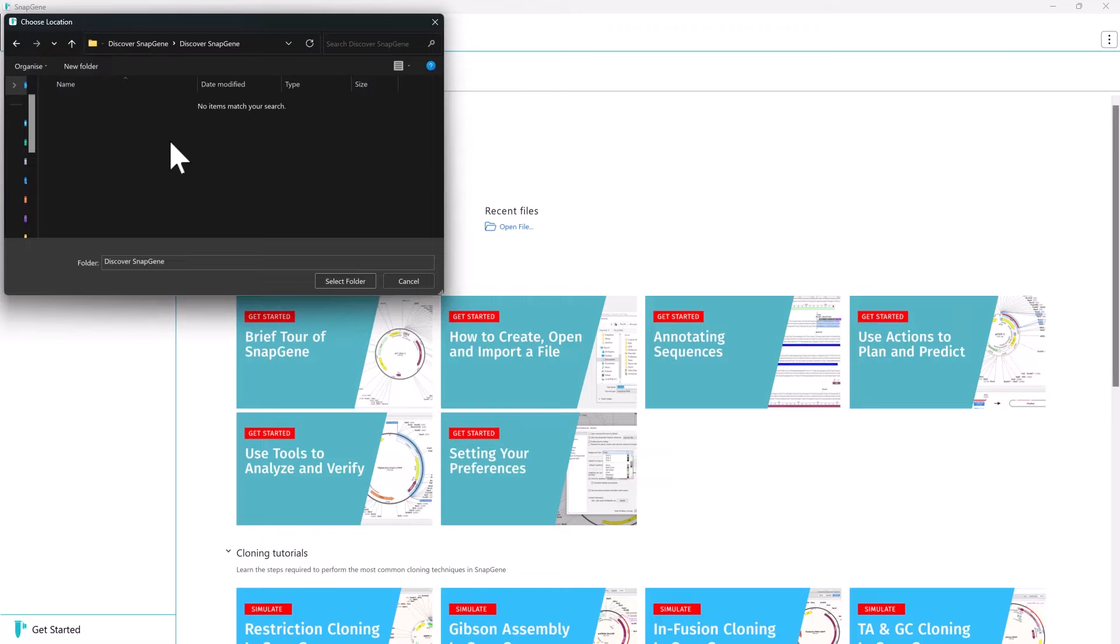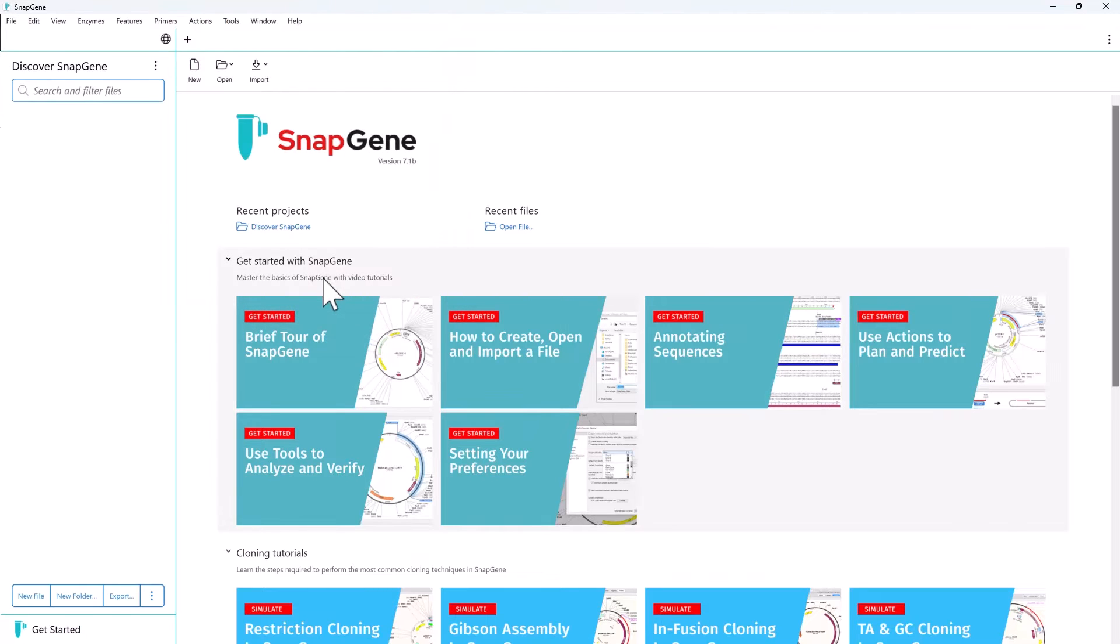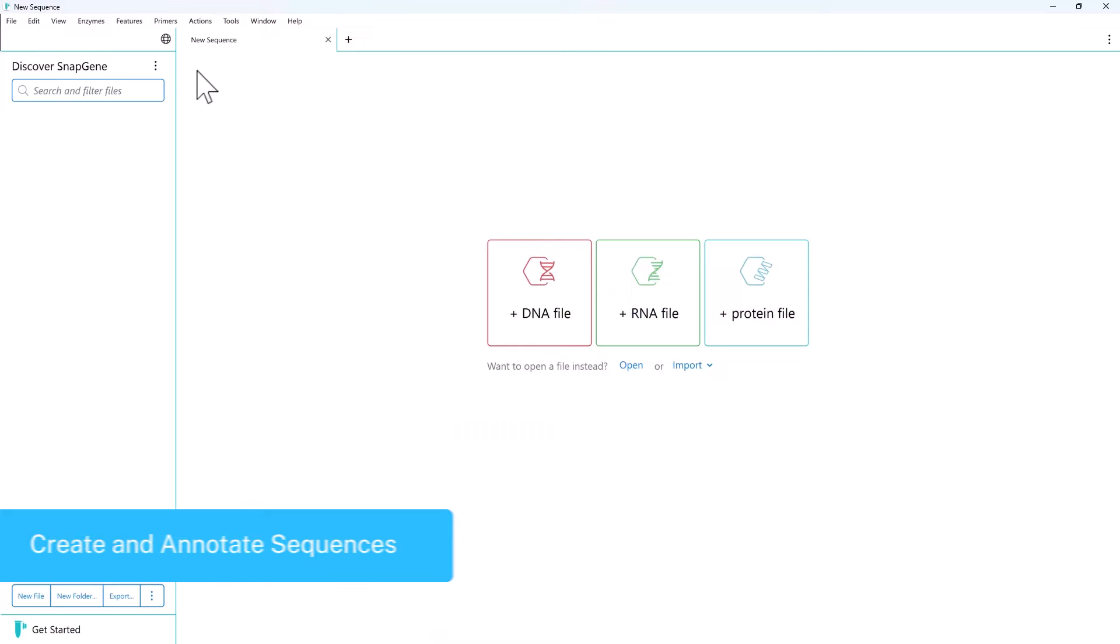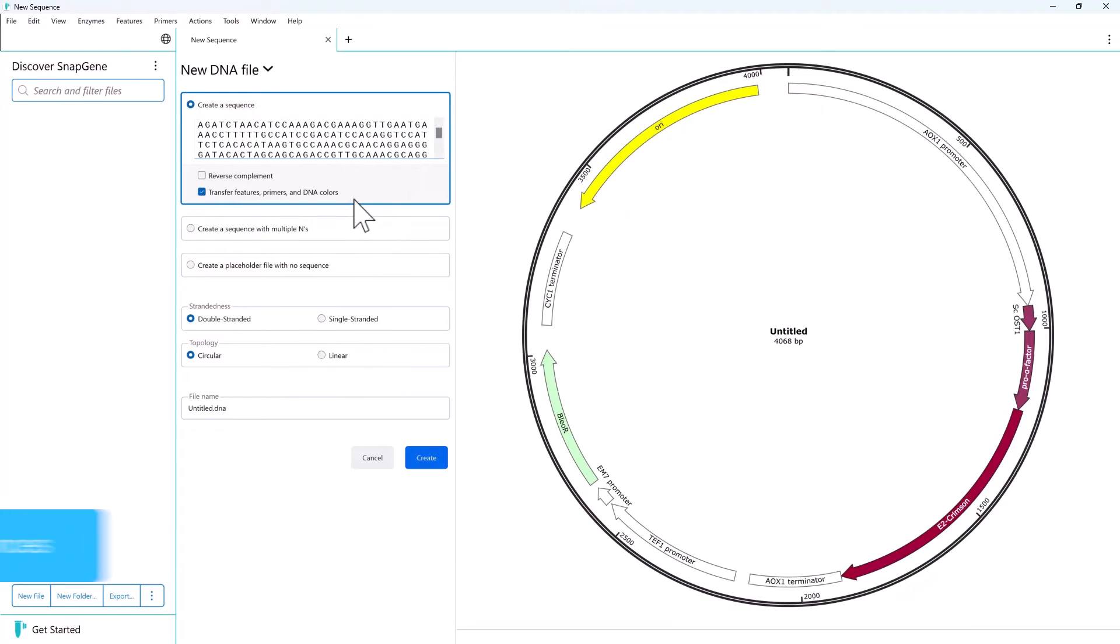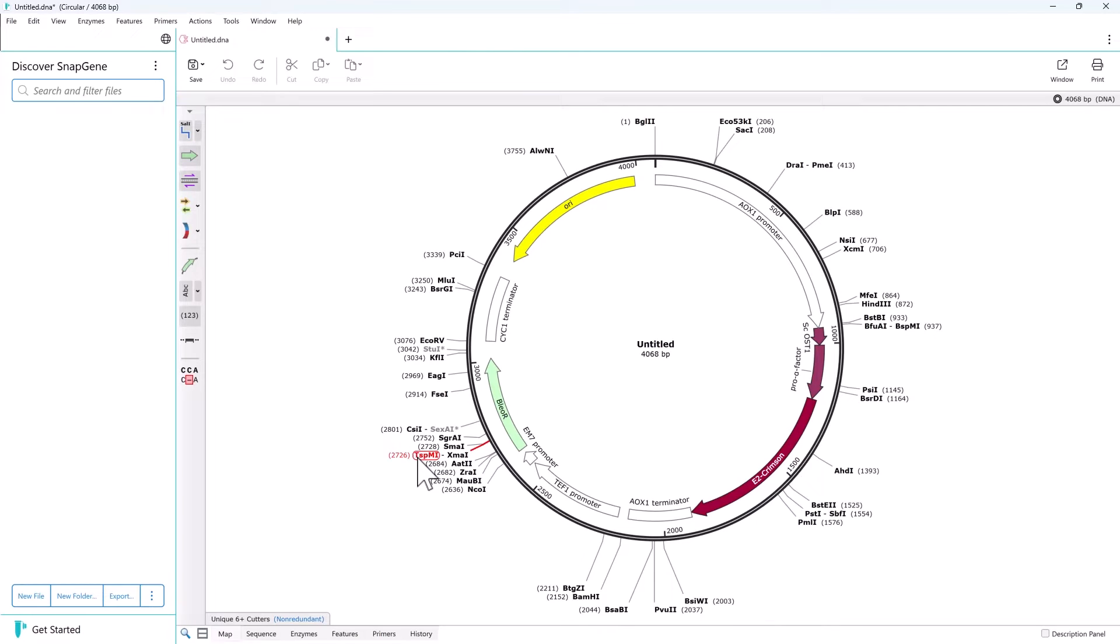Let's import a raw vector sequence into SnapGene. Paste the sequence into the new sequence window and SnapGene will automatically annotate the sequence using a curated library of common plasmid features. And just like that we've created an annotated plasmid displayed as a tab in the main SnapGene window.